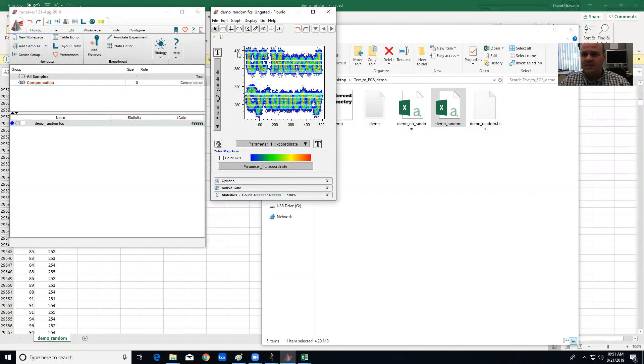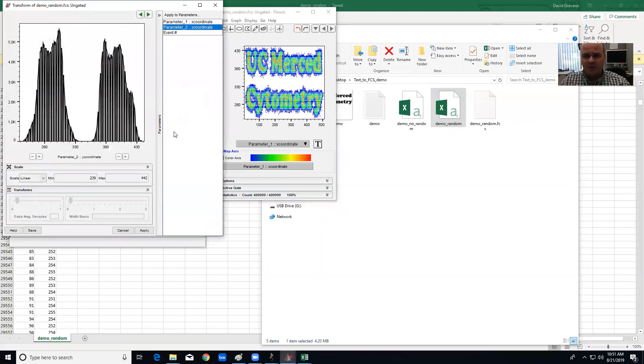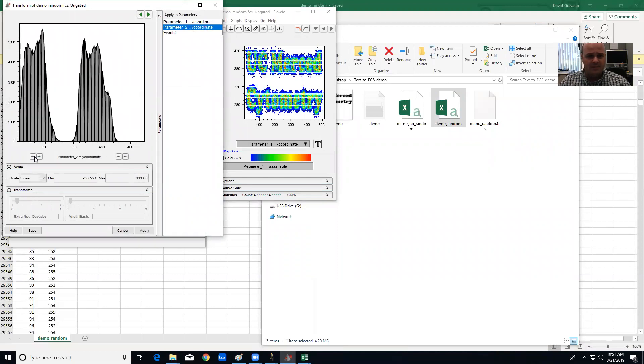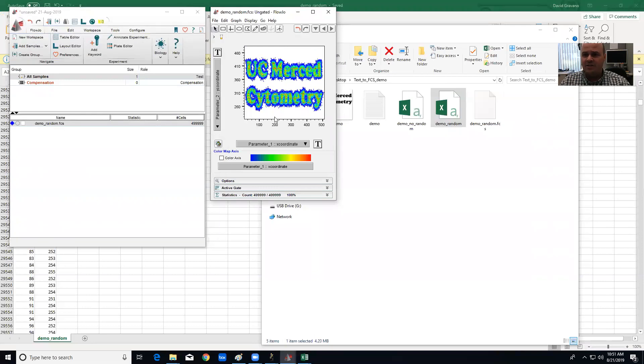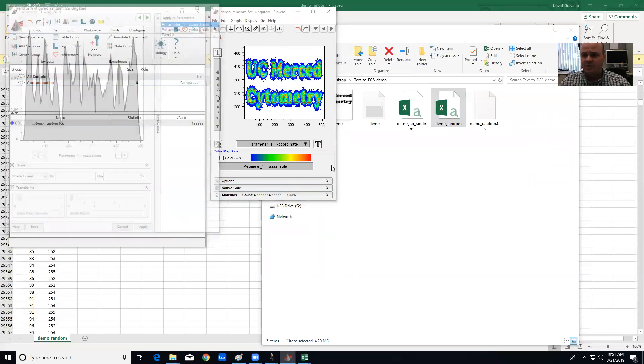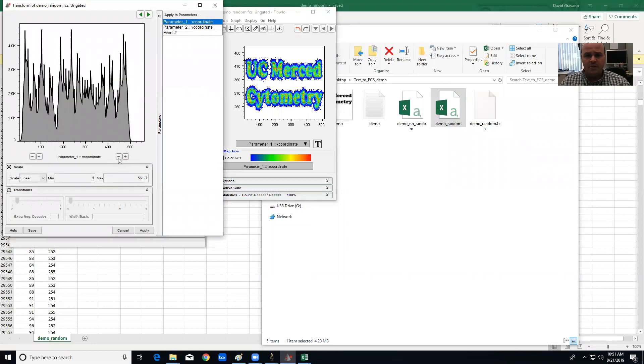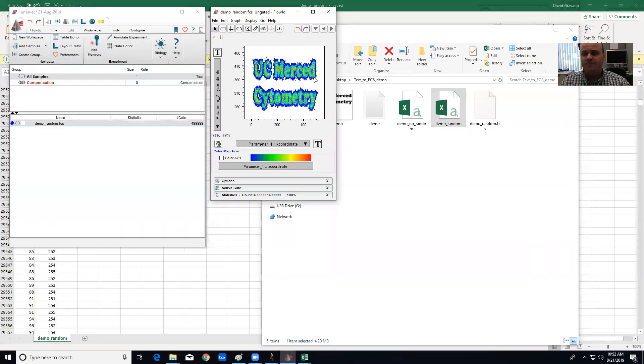But what you can see is it's got some noisiness to it. You see events spread out. We can customize the axis to make this look a little better. Let me do that to that axis and to that axis, apply.